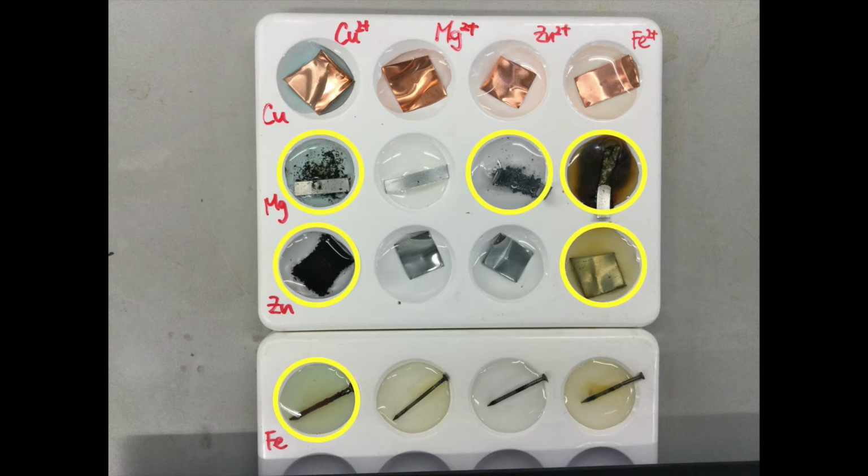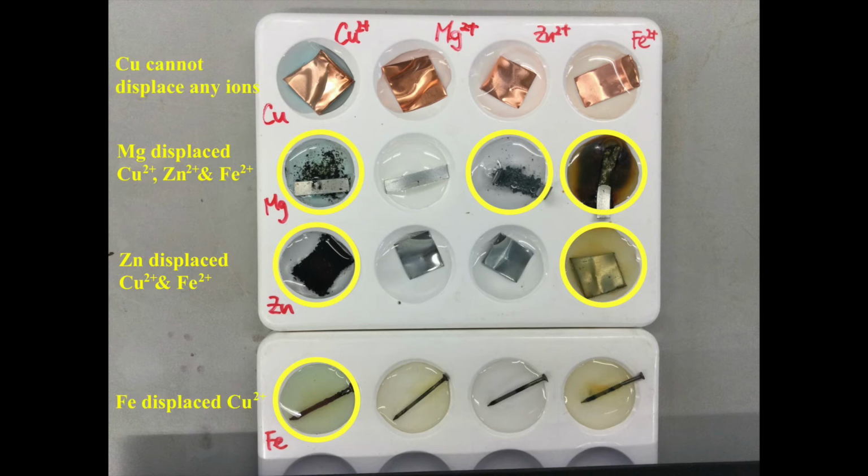Based on the observations, we can conclude that there are 6 reactions. Magnesium can displace all 3 ions. Zinc can displace copper-2 ion and iron-2 ion. And iron can only displace copper-2 ion, and lastly, copper cannot displace any ions. Therefore, we can conclude that magnesium is the most reactive metal, followed by zinc, followed by iron, and lastly, copper is the least reactive metal.